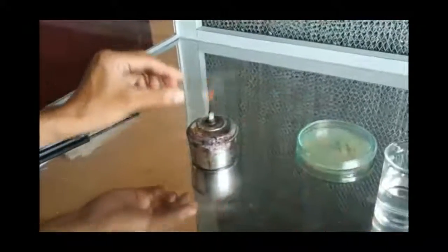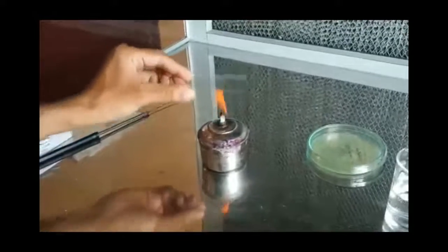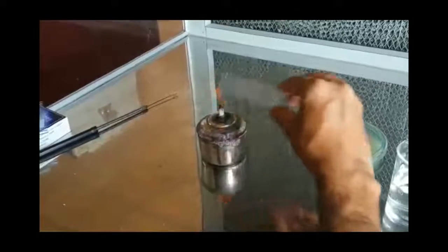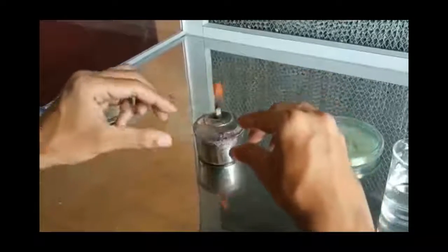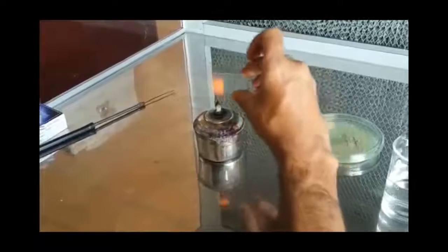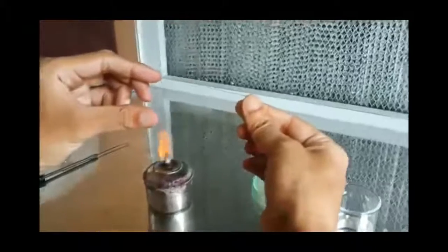And now we need to heat fix the smear that we have prepared. The reason why we need to heat fix the bacterial smear before staining is because heat fixing attaches the smear to the microscope slide, and it also allows the sample to more readily take up the stain.